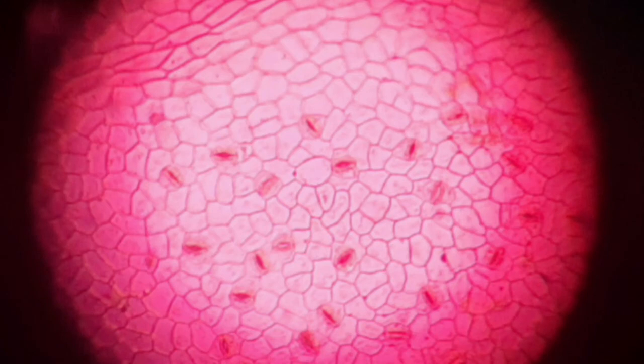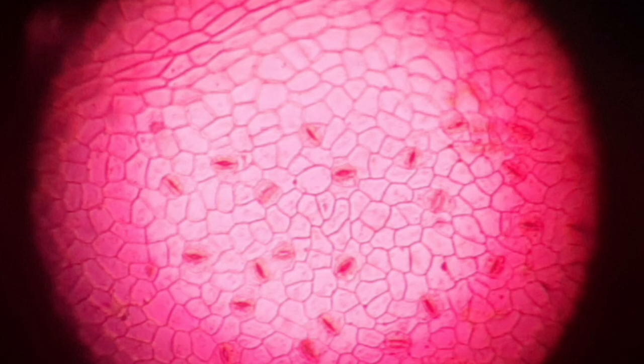But in case of a monocot plant, if we perform the activity using a monocot leaf, the guard cell will look like double dumbbell shaped. So this is the basic difference in the structure of these two types of angiosperms.